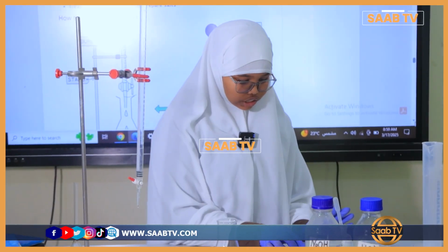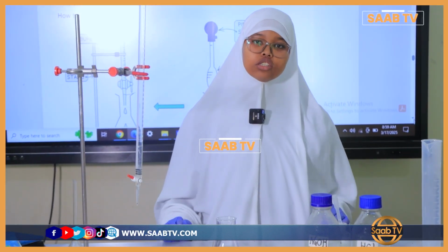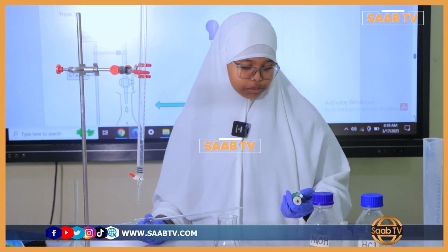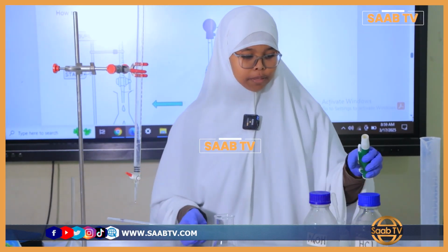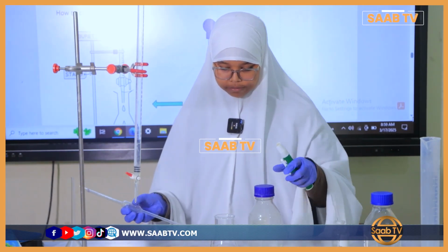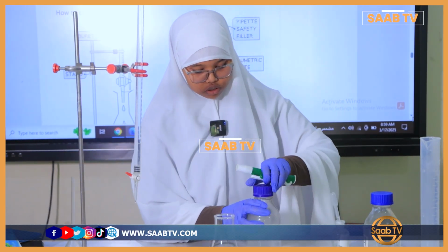Today we're going to do titration, and the aim of titration is to measure the amount of acid needed to neutralize an alkali. So first we need to get 25 cubic centimeters of an alkali. The alkali today is sodium hydroxide. So we'll do this first.